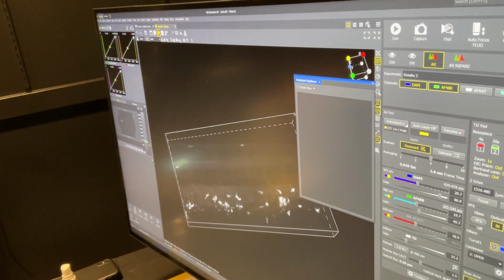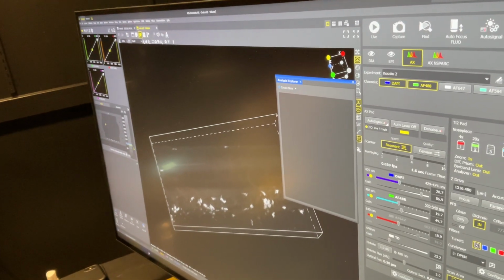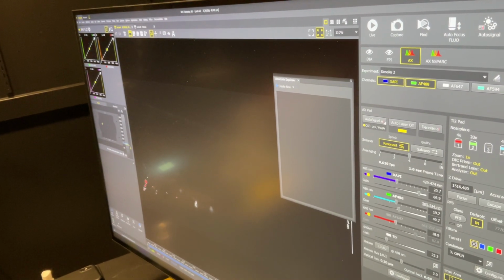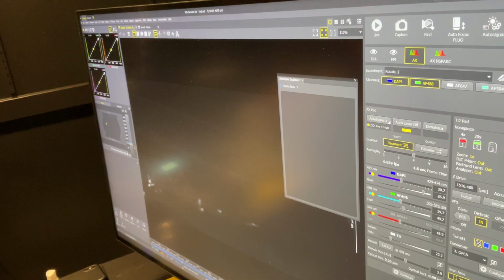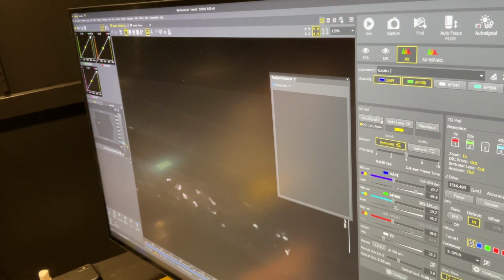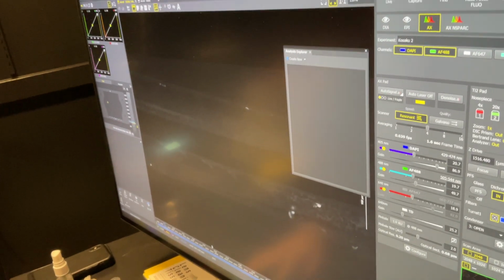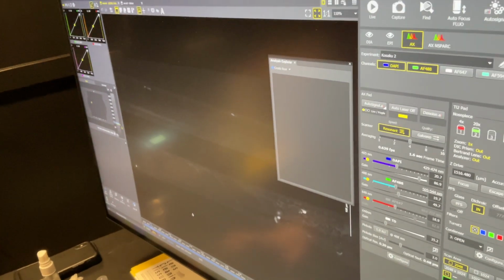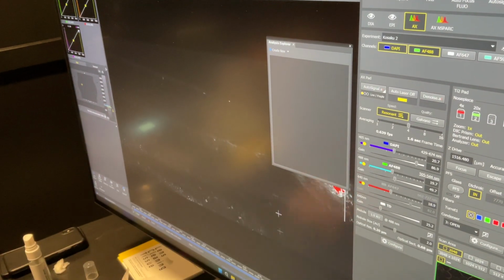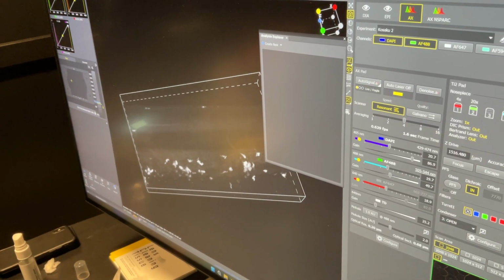One thing I will point out here immediately is that you have a lot of saturation. Oh, yeah, in the red? And a bunch of the channels. You can see them right here. This one, it's more over here. But I think there's some there, some there. So it's going to limit the information we're going to get out of this. But proof of concept will be fine. Same thing with this one. That's background, though, I don't care about that. But just a heads up that it's affecting what we're going to do here.